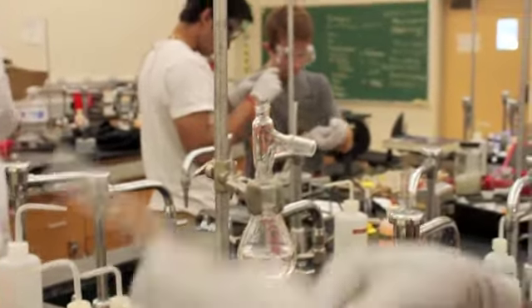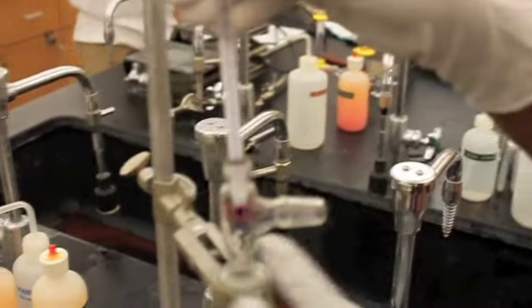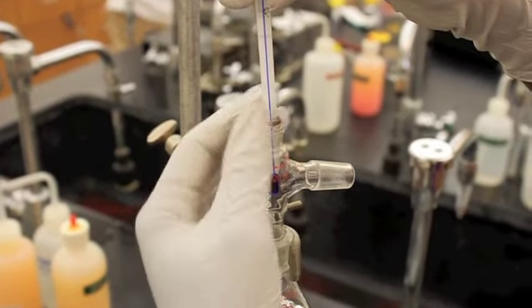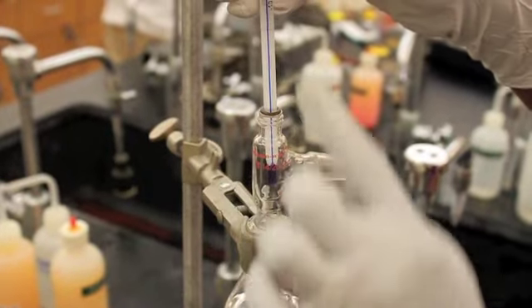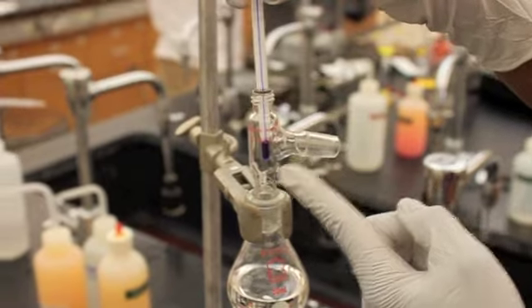Take your thermometer, place it into the O-ring that you put on the inside. As you insert it, ensure that it goes close to the bottom of where the joint is, the first joint. So the thermometer needs to face you, so you're able to read it, and the bottom of the thermometer needs to be secured back on.